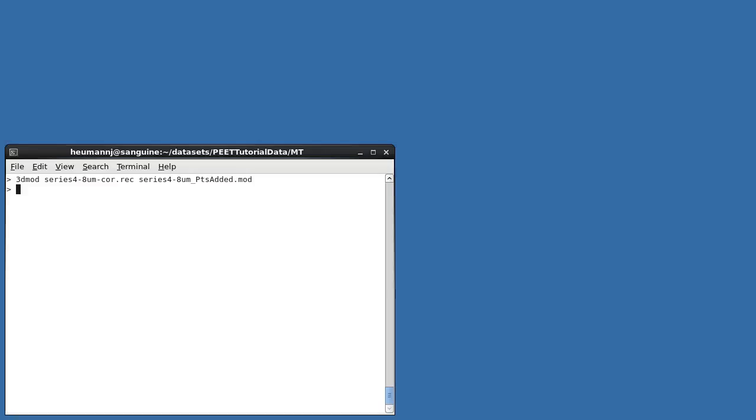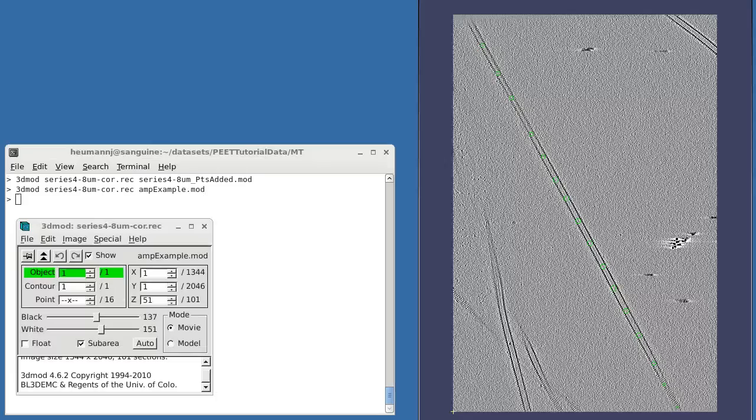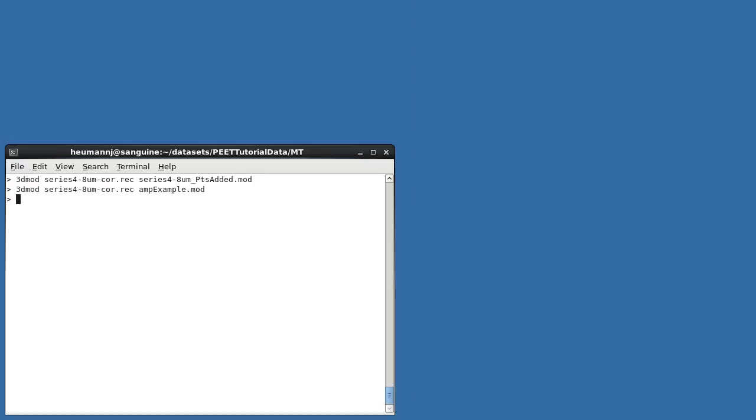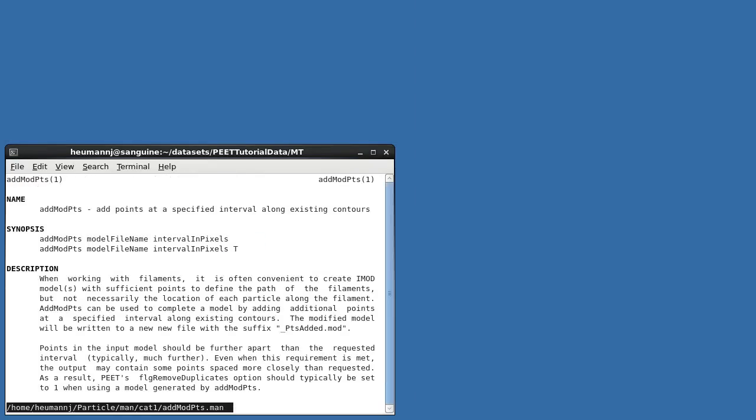I'll reopen the tomogram with a different model named AMP_example to illustrate how this works. In this model, you can see that I've added enough points to define the path of the microtubule. In fact, because this particular microtubule is quite straight, even fewer points could have been used.